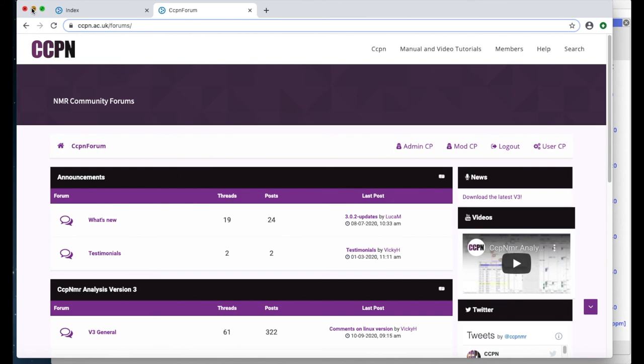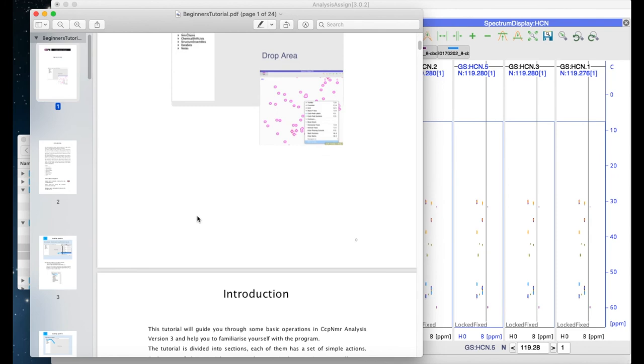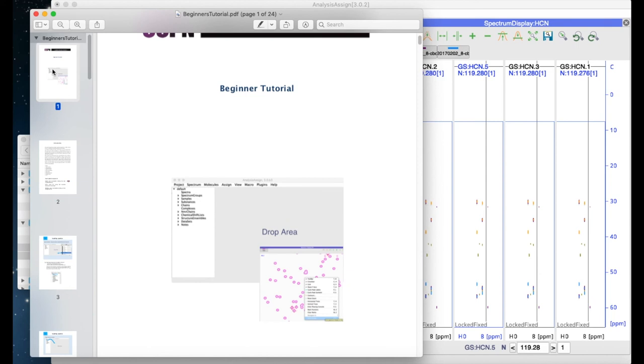We've also got a set of PDF-based tutorials. Simply click on this, bring up the tutorial file, and you can work through these in your own time to learn about different aspects of the program.